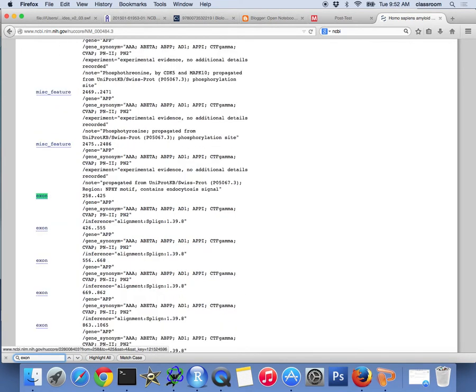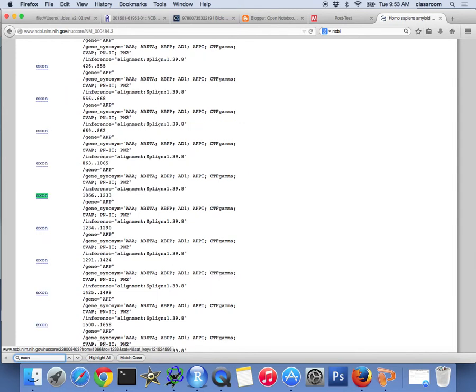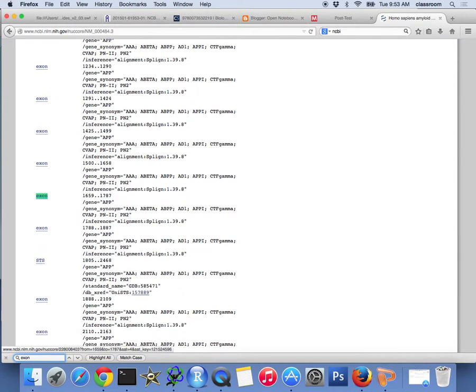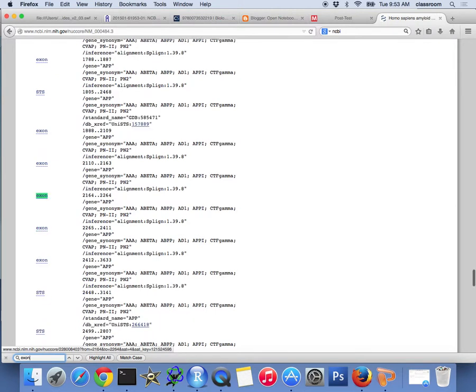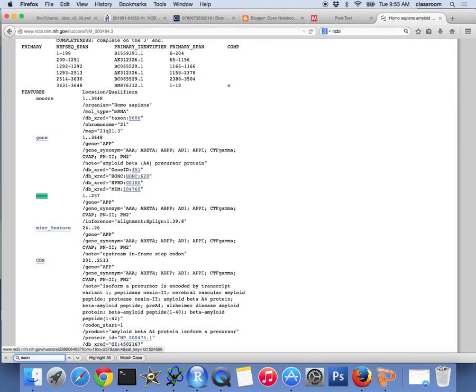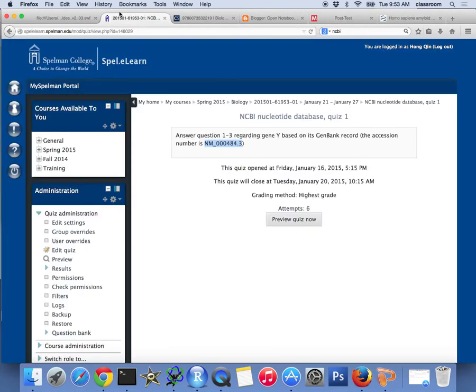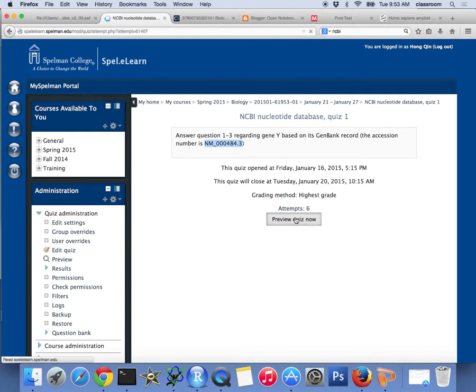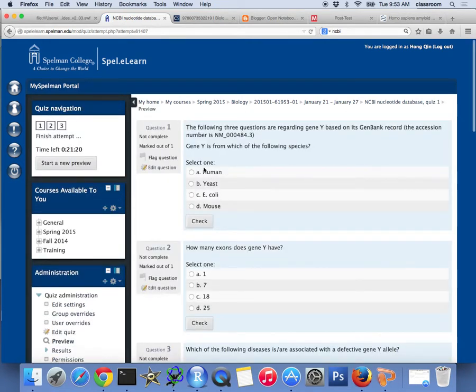I'm going to count 1, 2, 3, 4, 5, 6, 7, 8, 9, 10, 11, 12, 13, 14, 15, 16, 17, 18. So I count 18 exons. I'm going to trust you. So that's basically it. What else do we need to answer the question?